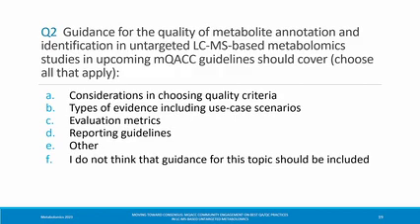I had a question on annotations, because machine learning methods are starting to be used to generate annotations, and those seem different to me than using a reference database or an authentic standard. So I was wondering if there was going to be any discussion around how you report your guidelines or your quality criteria for machine learning generated annotations.